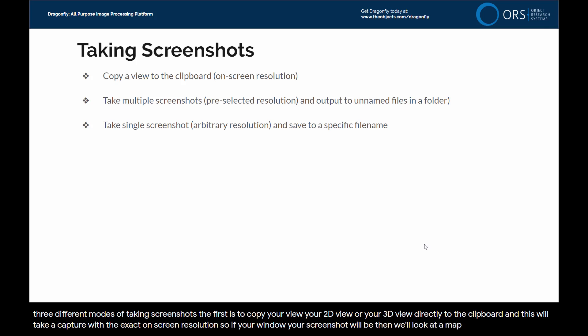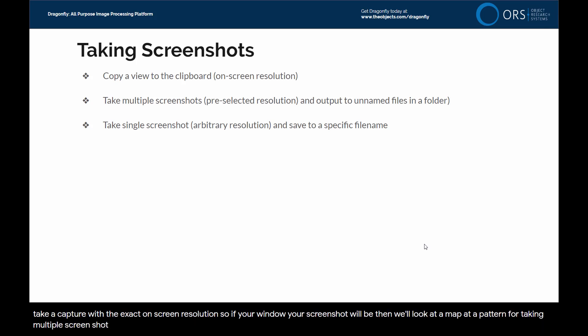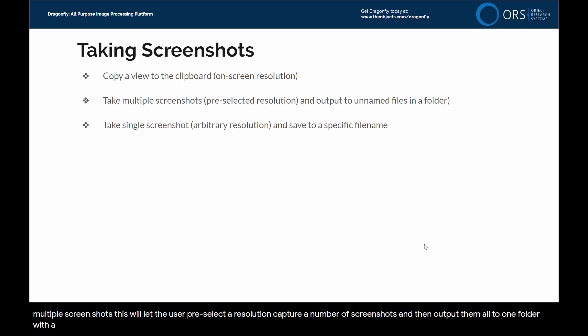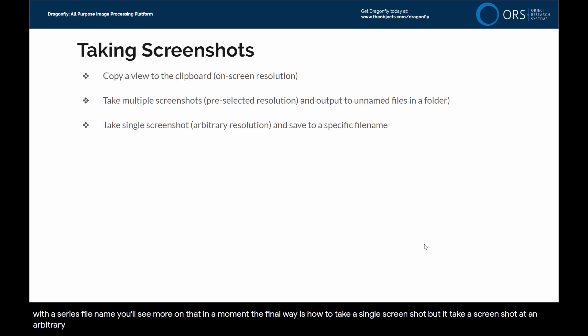This will take a capture with the exact on-screen resolution. Then we'll look at a pattern for taking multiple screenshots. This will let the user pre-select a resolution, capture a number of screenshots, and then output them all to one folder with a series file name. The final way is how to take a single screenshot at an arbitrary resolution.